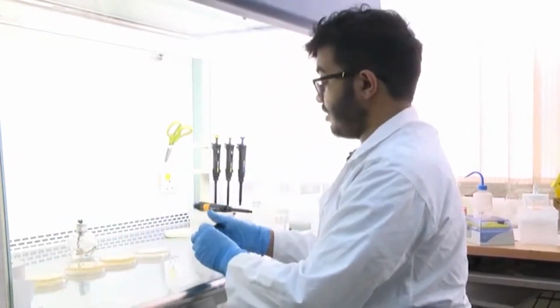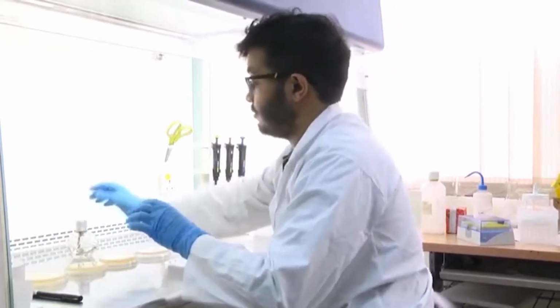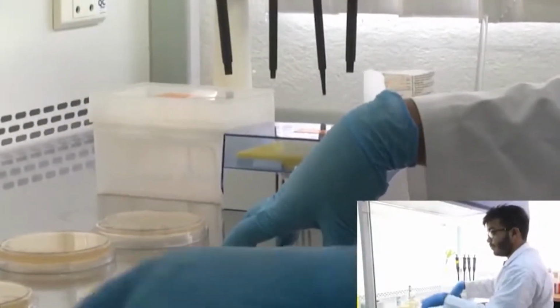Yes, now that we are done, we can move on to the next part of our experiment. So now, we prepared 4 different plates, right?